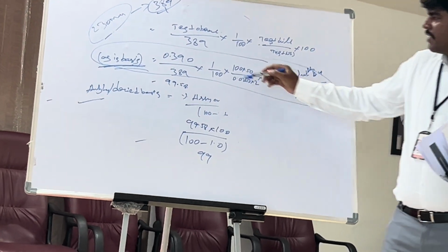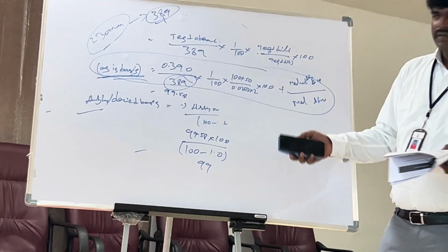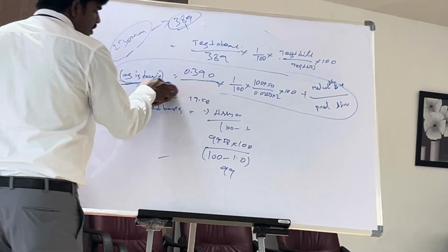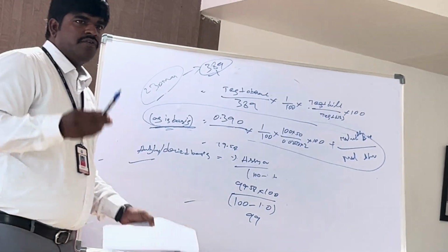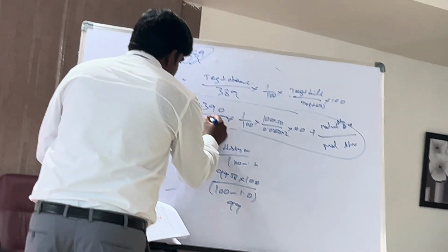So this is with respect to the specific absorbance. In a similar way, if you are given a standard and a sample, in those cases you don't need to do anything. Here, whatever the specific absorbance, you will simply write the standard absorbance. First you measure the 5 replicates of the standard and get some absorbance, say 0.390.